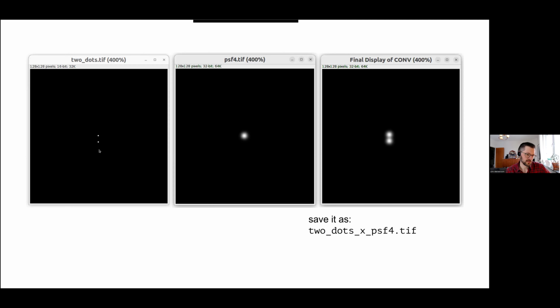It simulates what would happen if you image something that is super tiny and there's a point spread function that spreads it out. In this case it's just a Gaussian function, so it looks similar to STED maybe. What you would see is these two bigger balls, the two point spread functions, one overlapping each input point, and they are just about resolvable.